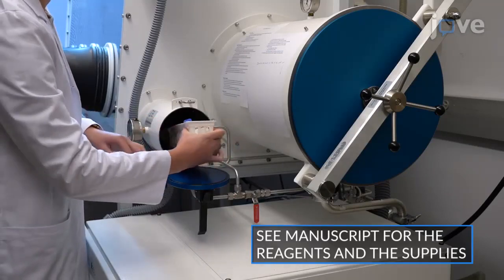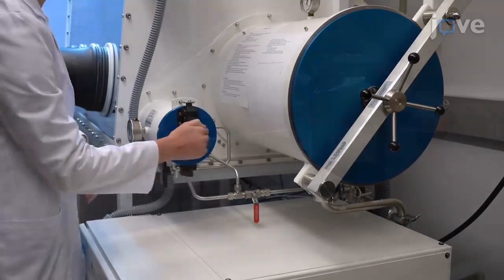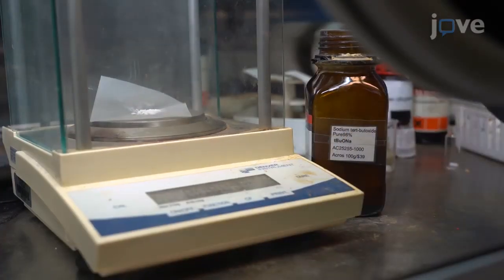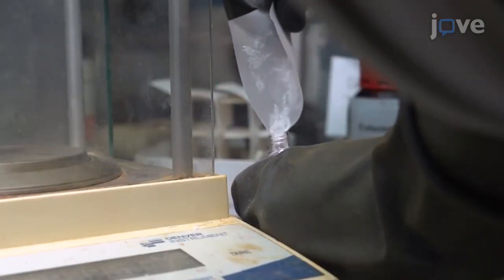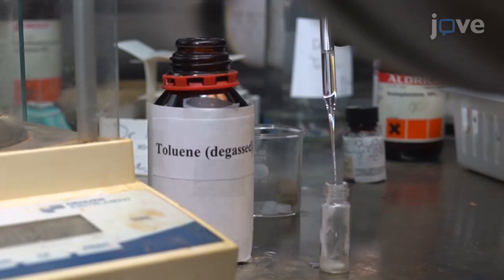Transport the needed reagents and supplies into the glove box. Inside the purged glove box, weigh 115 milligrams of sodium tert-butoxide directly into the 4 milliliter microwave reaction vial. Use a glass pipette to add 1 milliliter of degassed toluene into the microwave reaction vial.